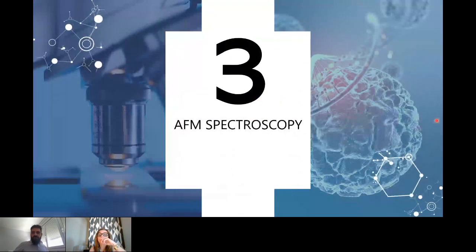Now, the third part of this webinar is about AFM for spectroscopy. This technique refers to the single point measurements in which the cantilever approaches and pokes into the sample and then withdraws. What can we do with this approach? There are 4 experiments that we can do.